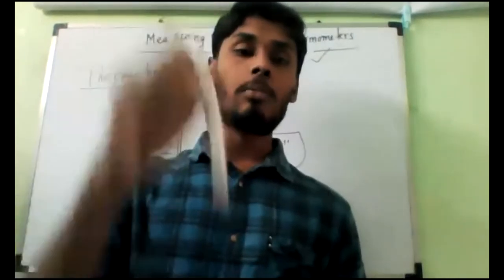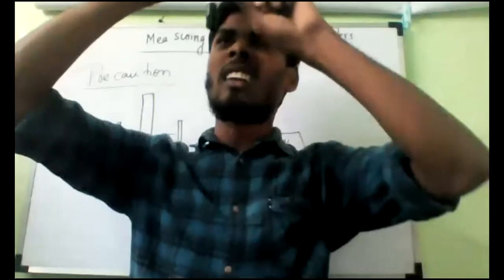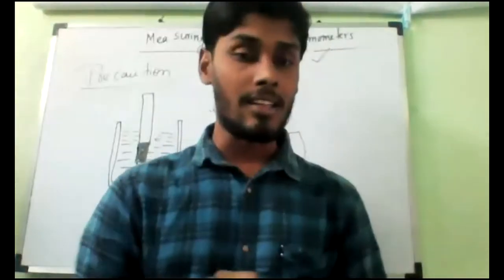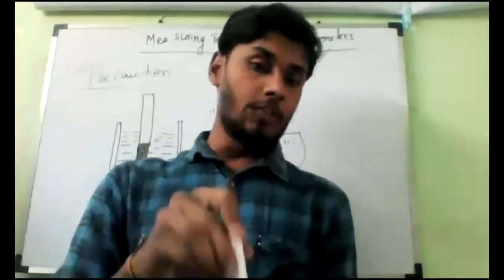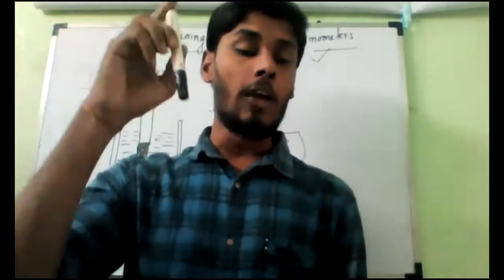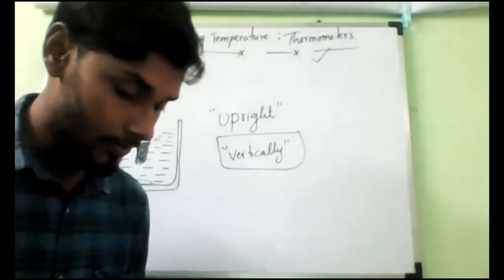Suppose I ask him to measure the temperature. Mari will insert it, and then he will lift it and see, sir, the temperature is 78 degrees Celsius, sir, or 60 degrees Celsius, sir, like that he will say. Now observe very carefully. If you immerse it and then lift it, what will happen, Mari? Definitely some change in temperature will take place. Is it yes or no? Will you accept it or not?